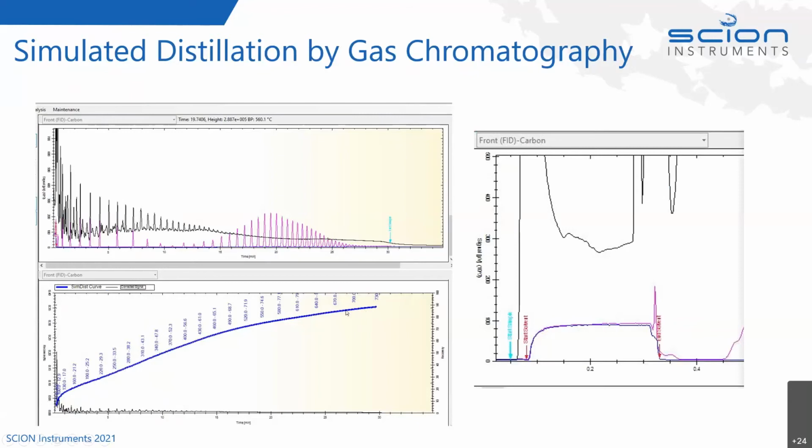So this is the Simdist, the blue line is the Simdist plot without any DHA analysis added. This is the analysis straight away from the Simdist software plugin. Now, the issue we're going to have with this analysis, especially at the really lower boiling point ranges, is the influence of the carbon disulfide, because it obscures the elution of the really light material in the crude oil sample. There are some quenching factors in the software, but what would be better is for us to run a DHA analysis and add to the very bottom of this curve, which is quite an important area. It's where the naphthas are, so it's really important for us to get this information. It makes it much more accurate when we combine it, as we'll see.